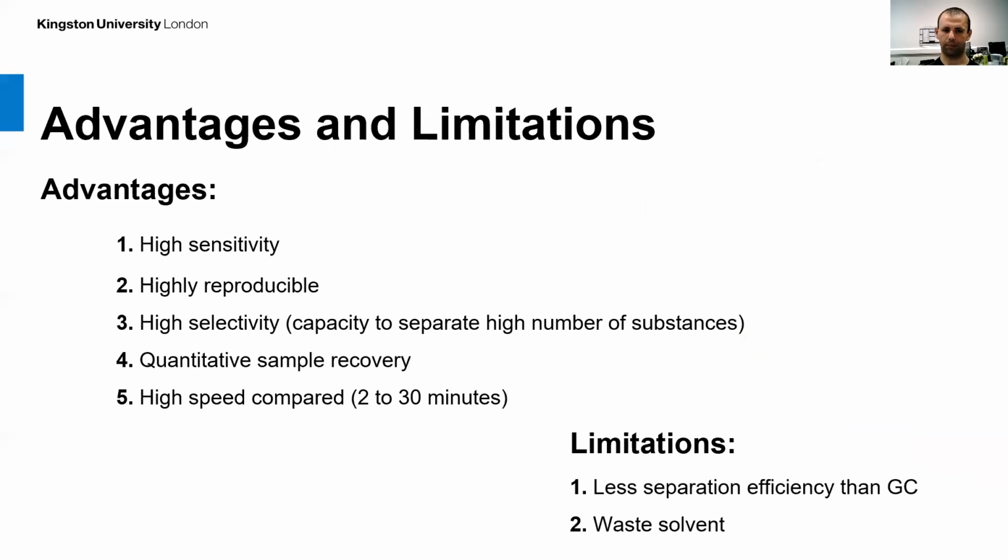Now we will be talking about the advantages and disadvantages of HPLC. One of the advantages of HPLC is that it is a highly sensitive and reproducible technique, and it is highly selective. It offers quantitative sample recovery and high speed compared to other techniques, usually a runtime between 2 to 30 minutes. Limitation, one of the disadvantages is that it has less separation efficiency than gas chromatography, and it produces waste solvents.